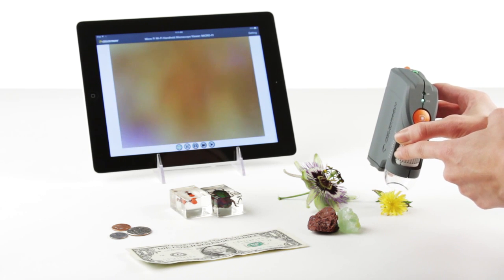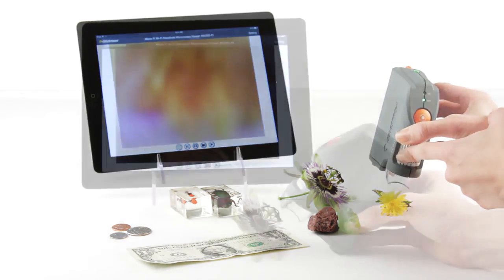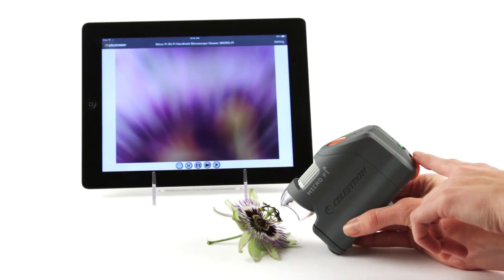Adjust the magnification and focus by turning the focus wheel. To add more illumination to your subject, turn the brightness knob.